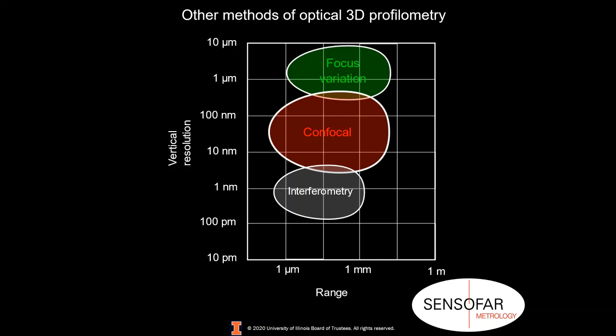Okay, and one more for you, Julio, right now. In your opinion, are there any practical differences between the companies that offer microscopes with confocal pinholes versus confocal slits or windows? I have restricted experience with different companies there.